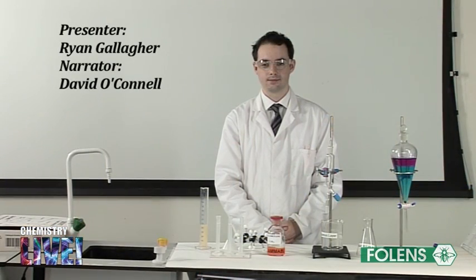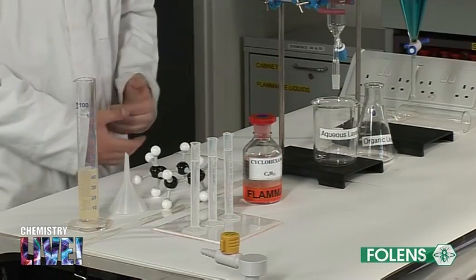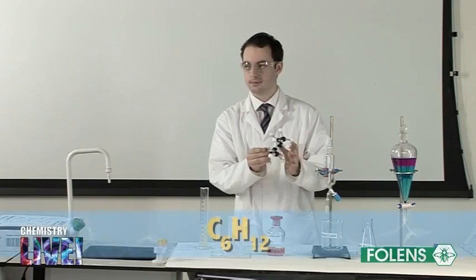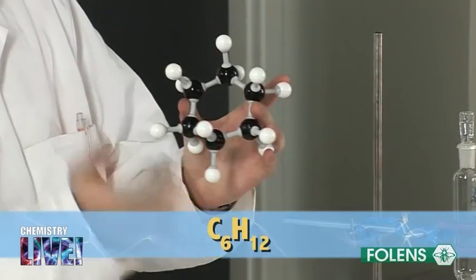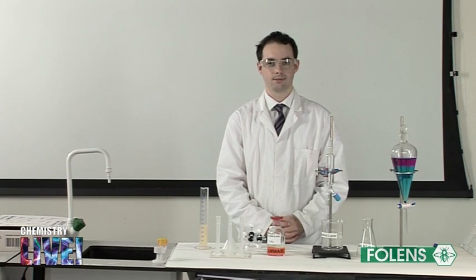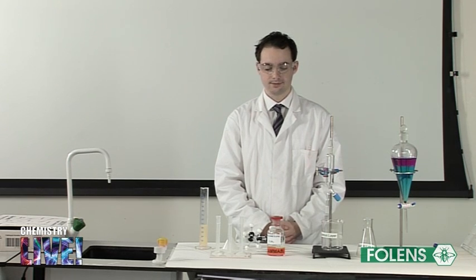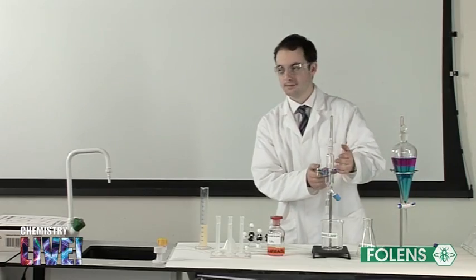This involves adding an organic solvent such as cyclohexane to the clove oil emulsion. Cyclohexane has the formula C6H12. The cyclohexane dissolves the oil of cloves in the emulsion but does not mix with the water. The organic solution, containing cyclohexane and dissolved oil of cloves, is then separated from the water using a separating funnel.